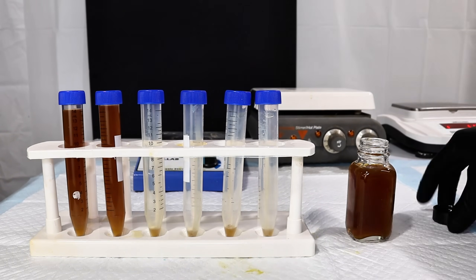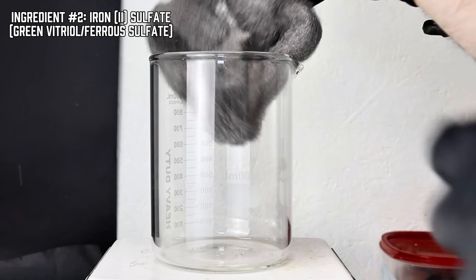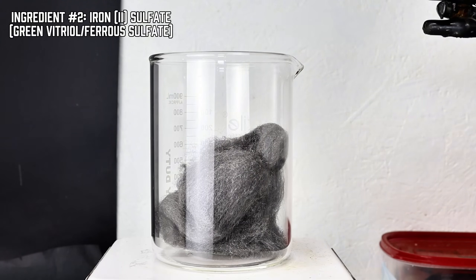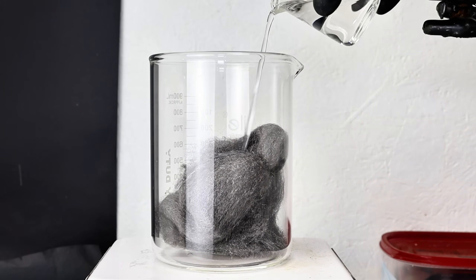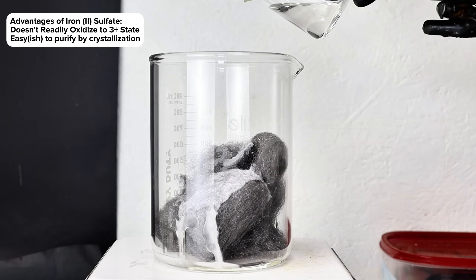Now that I had tannin, it was time to make our other ingredient: iron 2 sulfate, or green vitriol as it was called. If you want to be technical, any iron 2 salt would work here, but iron 2 sulfate works particularly well as it doesn't readily oxidize and crystallizes a lot easier.